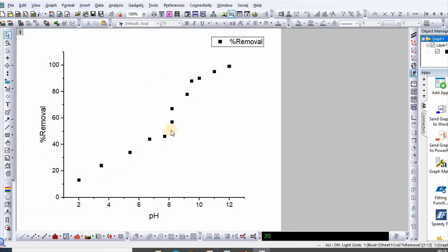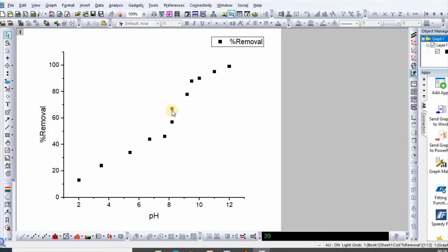So here is your adsorption case plot. And after some modification, for example, you can change symbol and size.